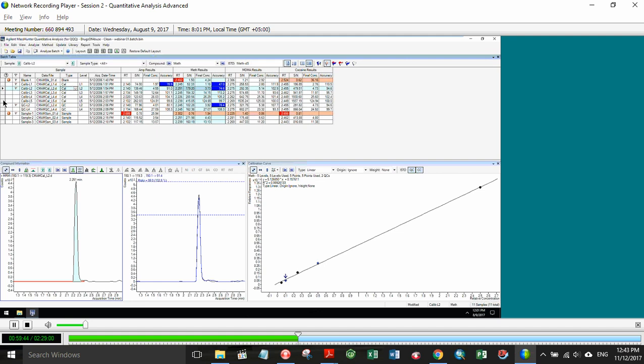It was not used in determination of that curve. This is also illustrated right above there where it says 5 levels used. That's the L1 through the L5 in the batch table. And then we have 2 QCs, L2 and L4 in this case.